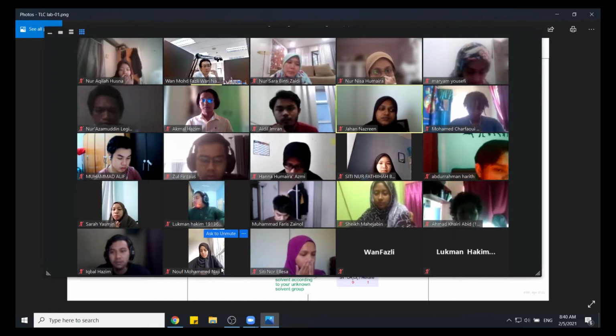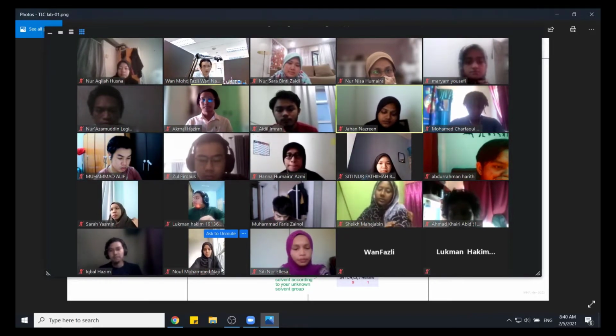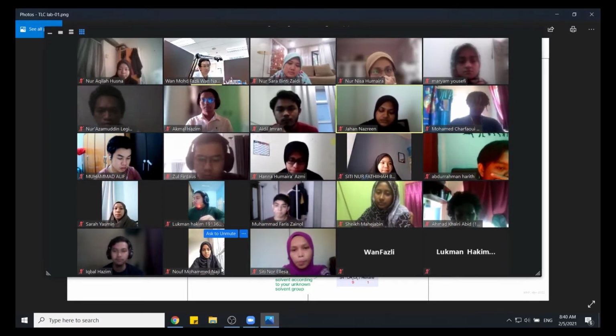Okay, welcome everyone to the live stream. So this is a live stream about the identification of unknown using TLC and melting point in combination.